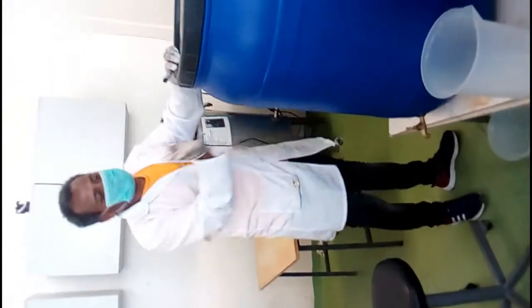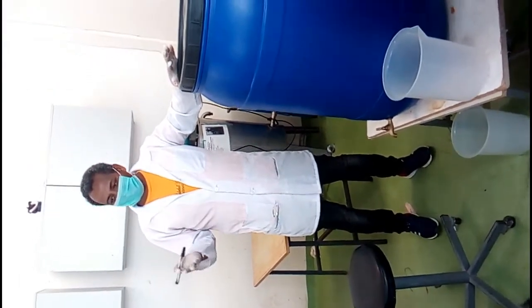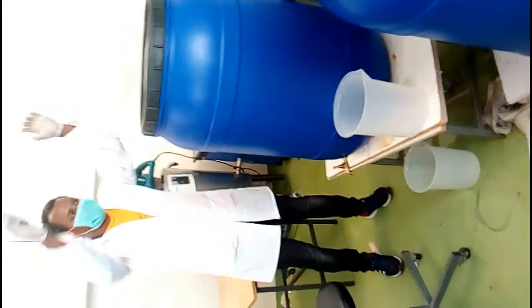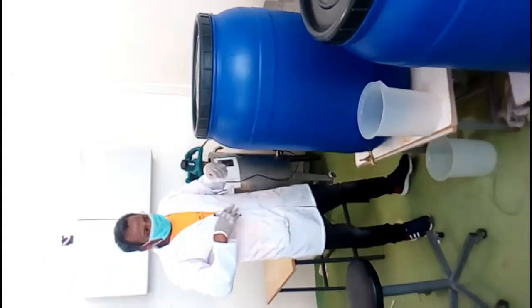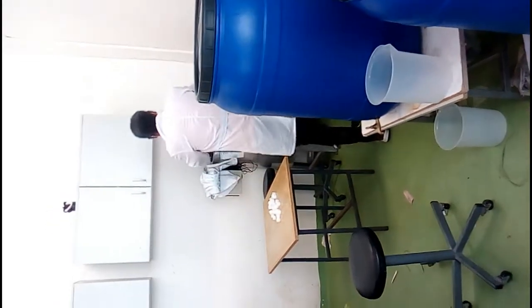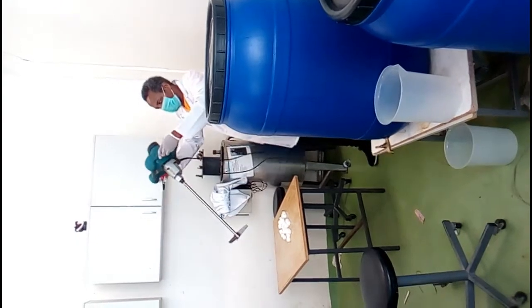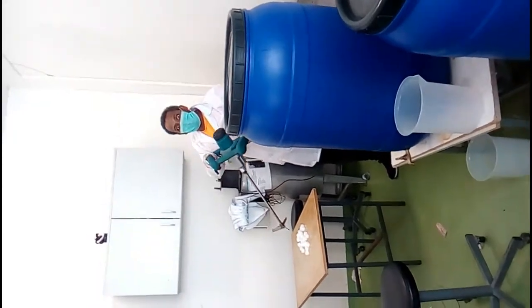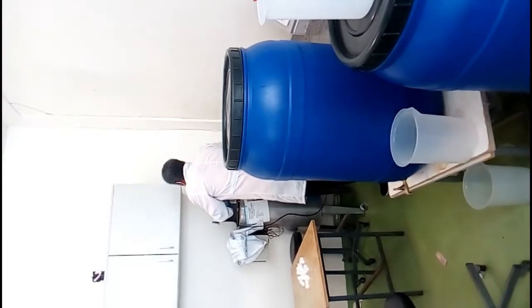And here, these are the final stage of our preparation of sanitizer. Once 3 or 4 of them are mixed, like distilled water, ethanol, hydrogen peroxide, and glycerol, they are mixed here. We can add here, and we can mix them with a mixer. This one is called a mixer. It is an electronic device. If you mix like this, it rotates like this. Then after that, it homogenizes. The 3 or 4 of them are mixed together in formulating.